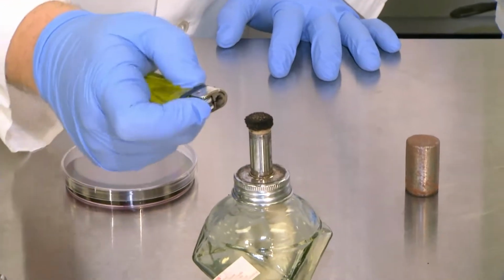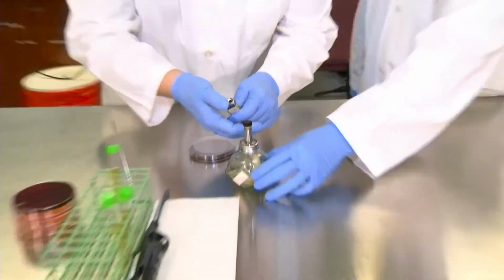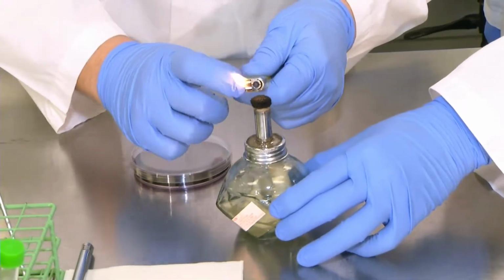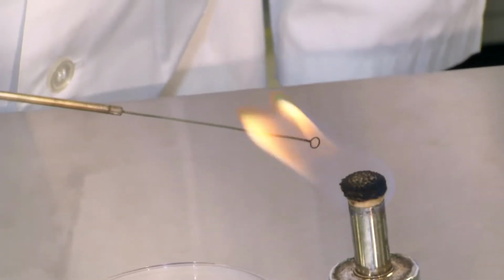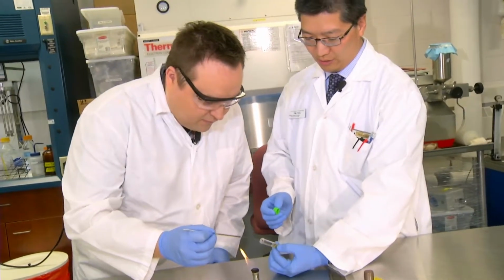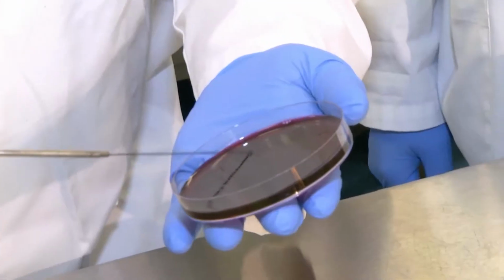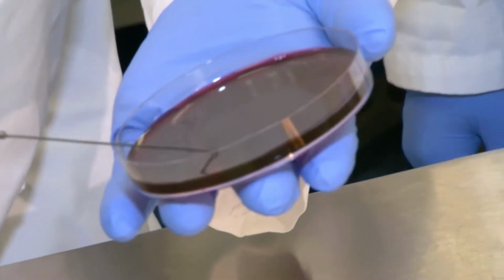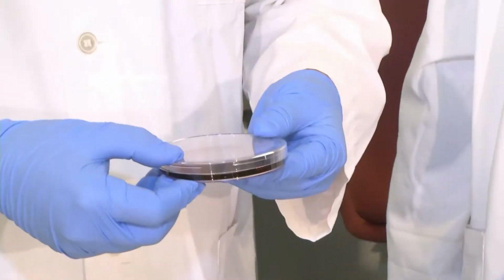See, I don't like lighters because I always feel like I burn my finger. Look at that, I'm gonna melt my glove. Okay. Right here. Okay, that lit very quickly. It's like I'm roasting a tiny marshmallow. And then I'll get you to put that into the tube to pick up your culture. It sizzles. Okay. And now we can take this plate and incubate it for 24 hours at 37 degrees.